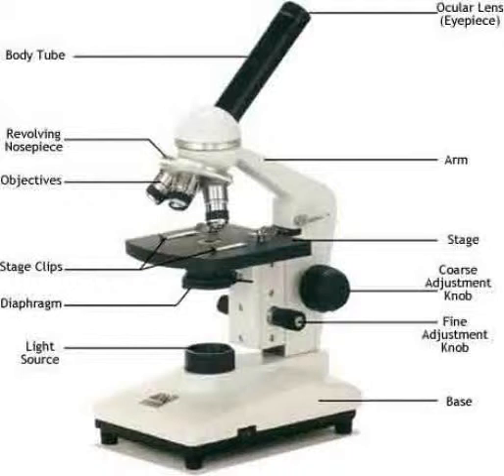2. Place the micro ruler slide on the microscope stage so that the millimeter scale is facing up. Locate the 1 millimeter markings, the largest divisions, under low power. Place 1 millimeter marking of your ruler at the far left-hand side of the low power field so that it is barely visible. You should see 1 other millimeter marking in your field of view. This means that your low power field is between 1 and 2 millimeters in diameter.